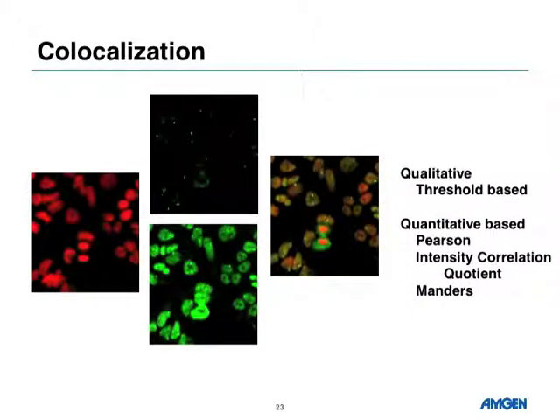Another thing that we've been using a lot is co-localization. What I have here is this image to talk about; these are the same images thresholded on different intensities. Often people use a co-localization method where you say, I have an intensity in one channel and an intensity in another channel, and if both are above that intensity, they must be co-localized. In a lot of papers you see something red and something green and it looks yellow and you say they're co-localized.